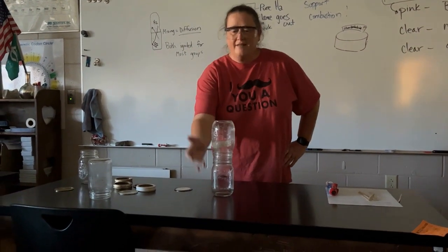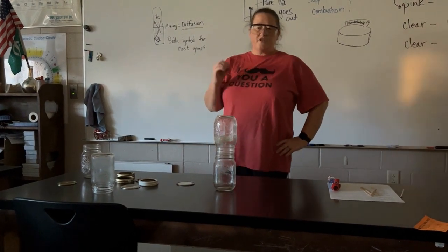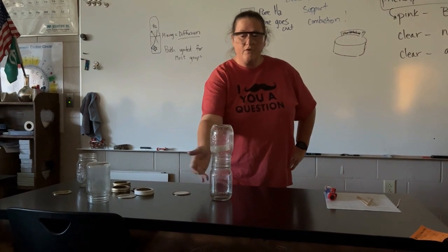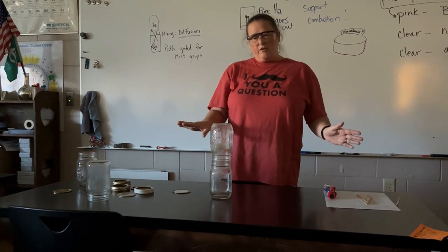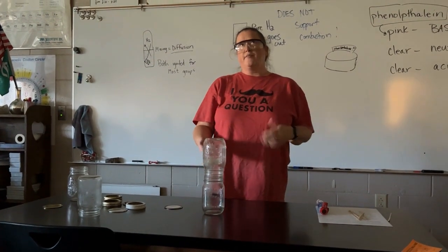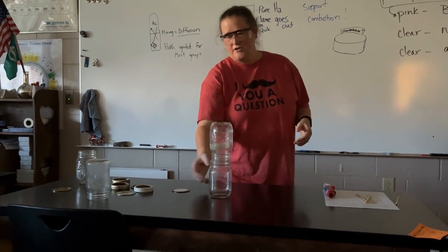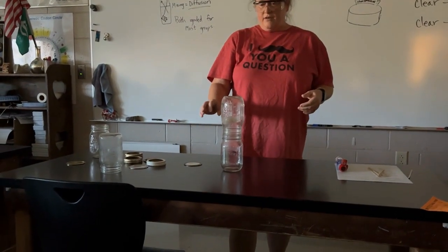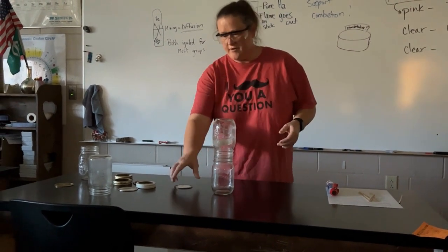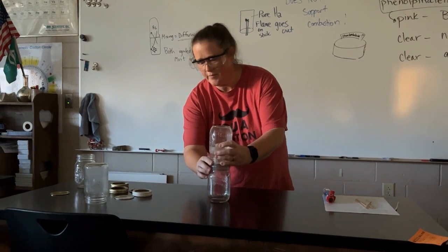Now, if we get this mixing, we should have both jars ignite, because hydrogen should be in both of them. If they don't both ignite, then it does not support that these gases actually diffuse, and that the hydrogen stayed here, the oxygen stayed there. Now, for the record, I will say that these two jars tipped over about 3 minutes ago, and I don't know what's going to happen, but let's hope I caught them in time.